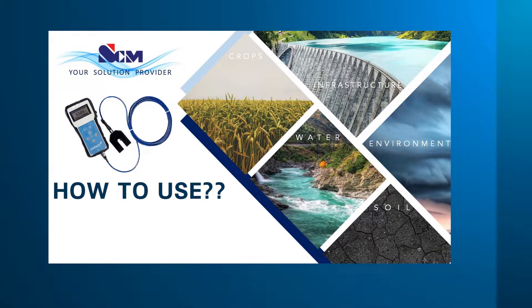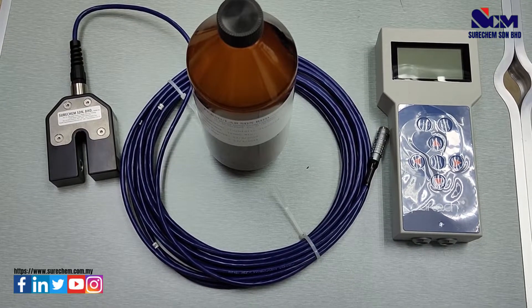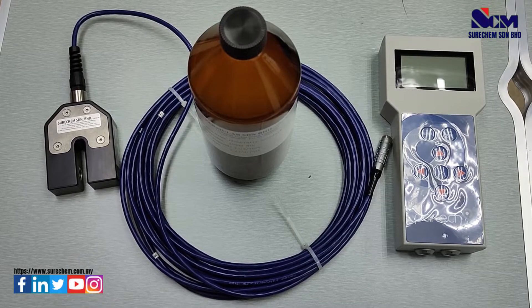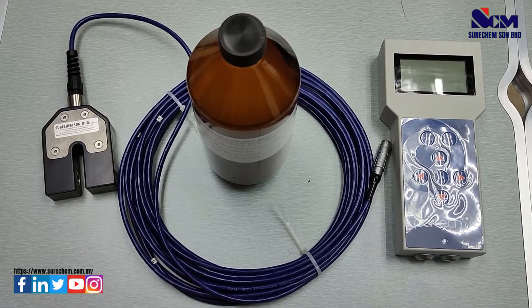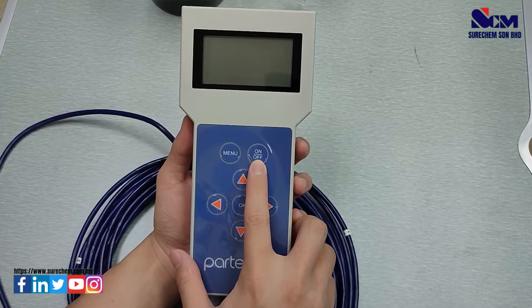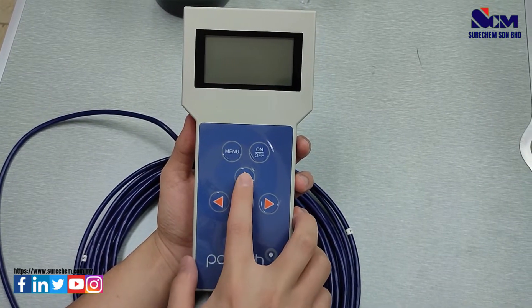We will teach you how to use the meter. We will cover how to perform calibration for turbidity measurement, and we will also go over the button functions: the on/off key, menu key, select key, and the cursor keys.